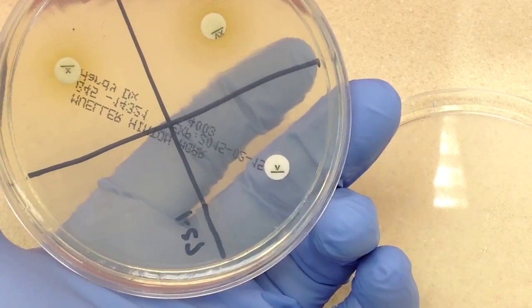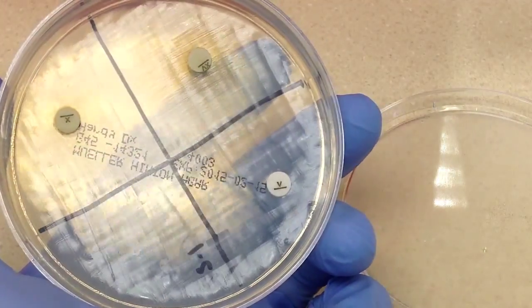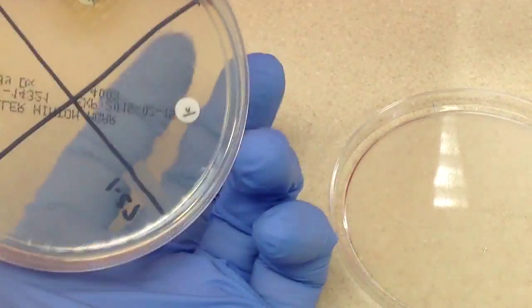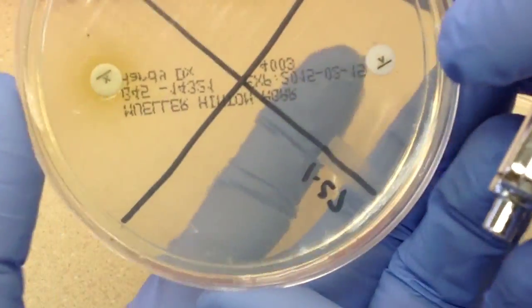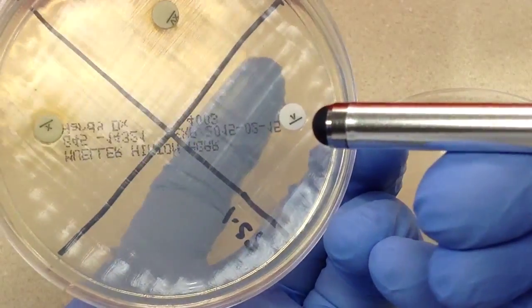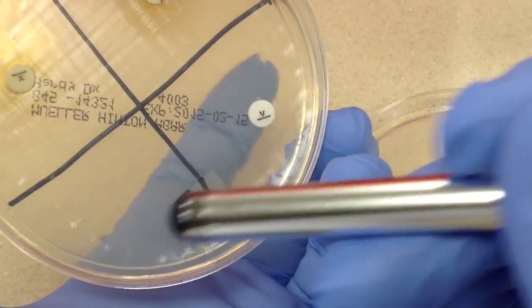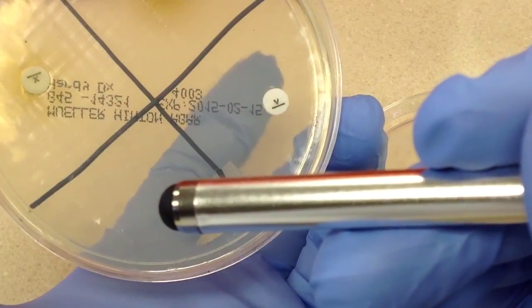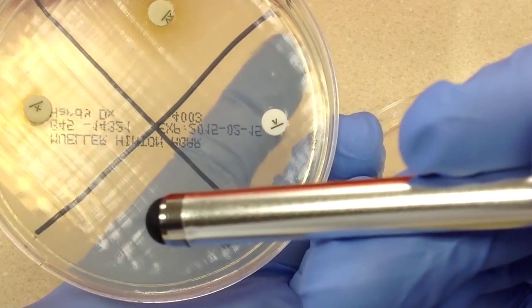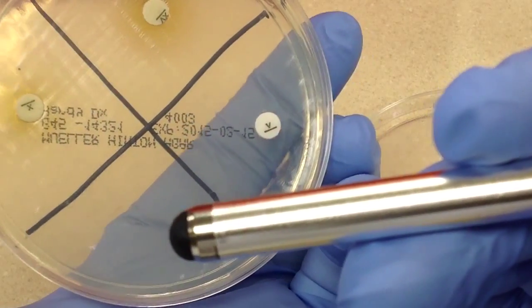Now that is not what we're looking for. That is the color from the disc that's gone out into the media. So if I look at V, I don't see anything. If I look at X, I don't see any kind of growth. And of course over here, this is kind of our negative control. We shouldn't be seeing anything growing here because this Mueller-Hinton plate doesn't have either X or V in it.